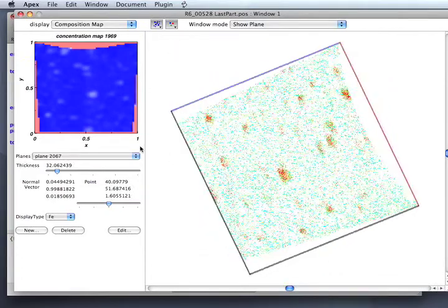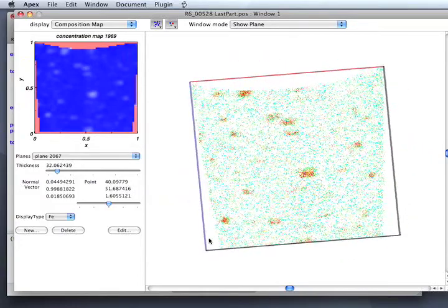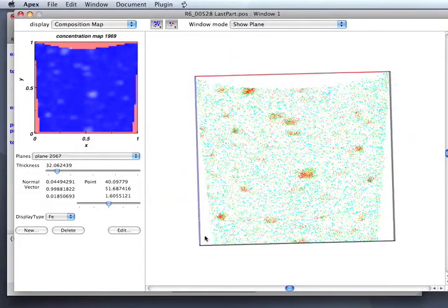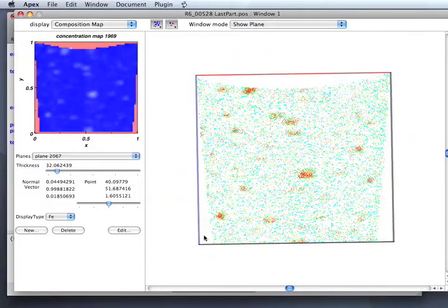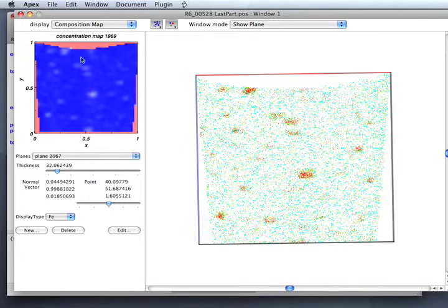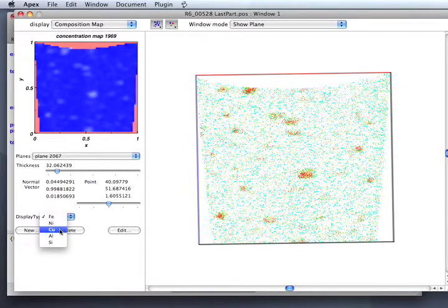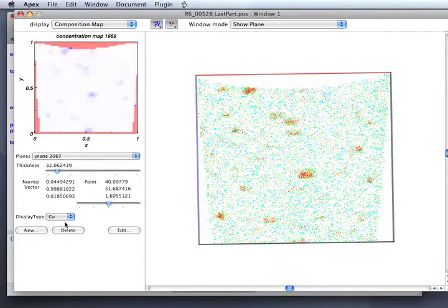Let me spin the box around to get it oriented the same way as the map. You can see these precipitates are represented in the map as deficient. That's because we're currently displaying iron, which is the majority component. If instead we display copper, you can see the precipitates showing up.